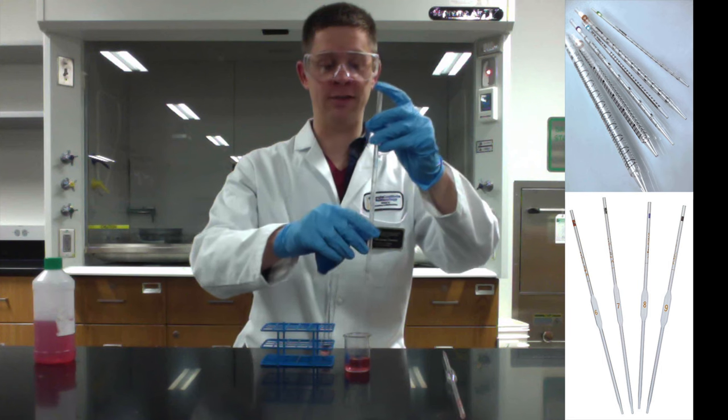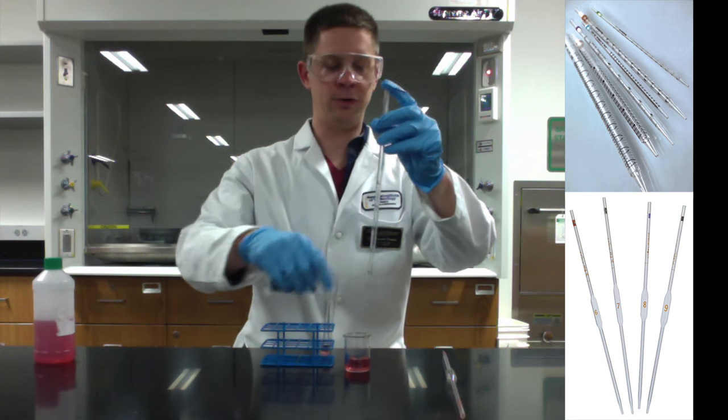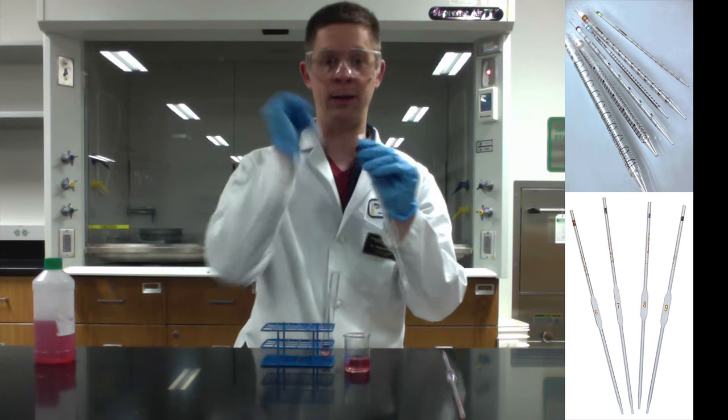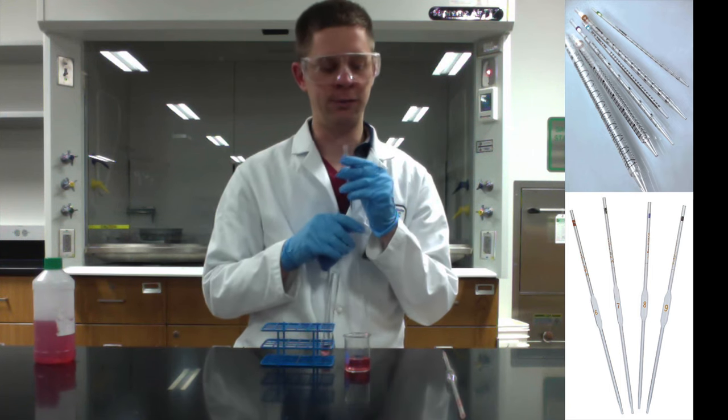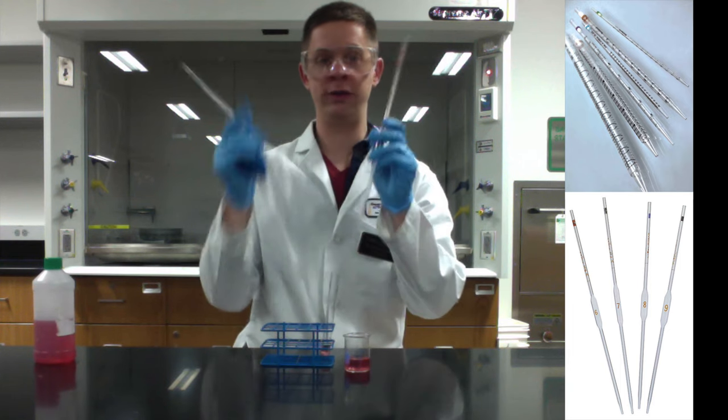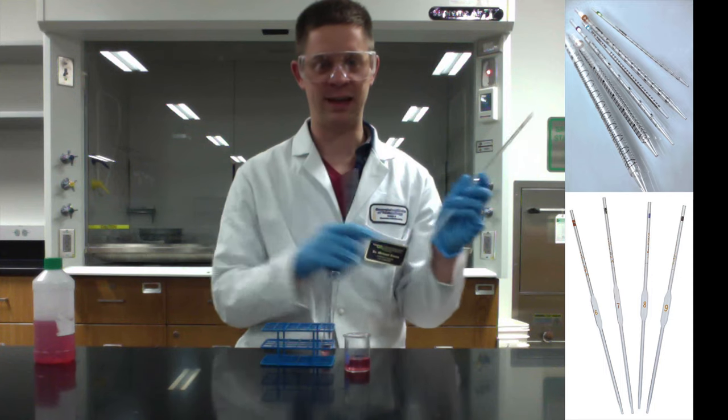For a serological, you can put it at the zero line and deliver by difference, or you can pull up using the smaller numbers to the volume you need to deliver and squirt in everything, blowing out the last little bit of liquid. For the volumetric, just release your finger and let everything go, making sure not to squirt in that last little bit of liquid.